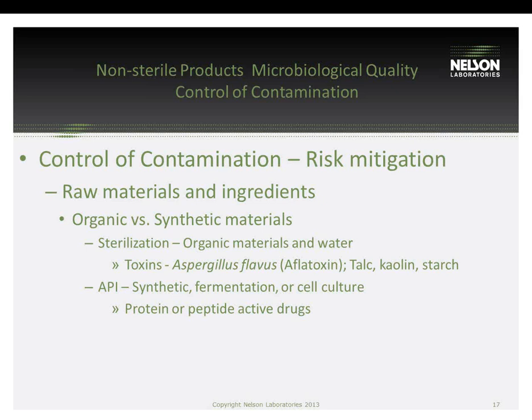Generally, with non-sterile products, toxins aren't quite an issue. However, I have this here just to lay out that it's important to audit your suppliers for non-sterile products. You don't want the supplier to have an environment that would be favorable for organisms to grow.